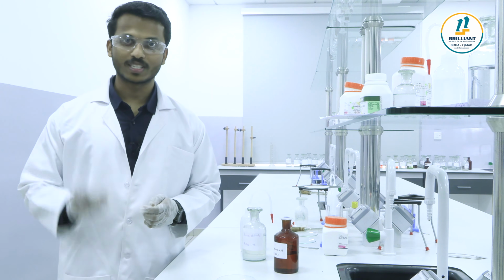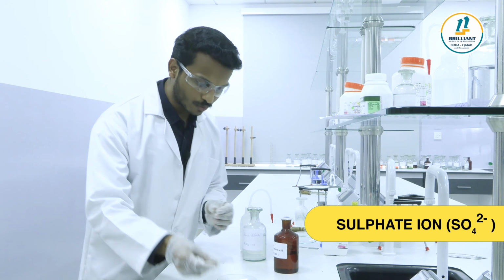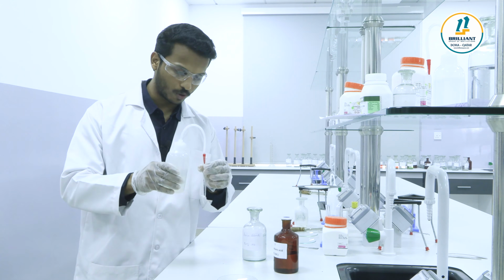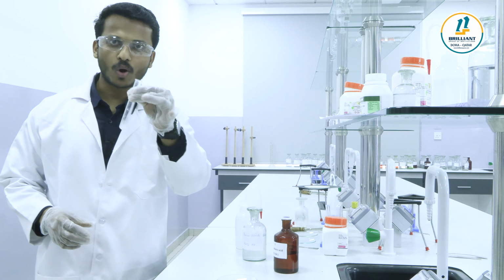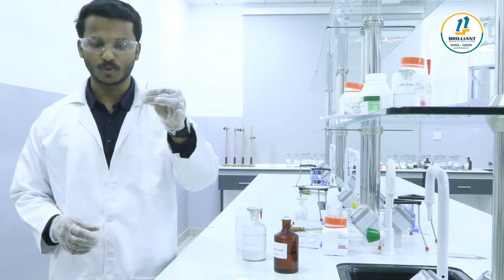Let's go for the test for sulfate anion, SO4 2-. First, let's go for the preliminary test. Take a little of salt and add some amount of water. Make it a solution. To a little of salt solution, add barium chloride solution, BaCl2.